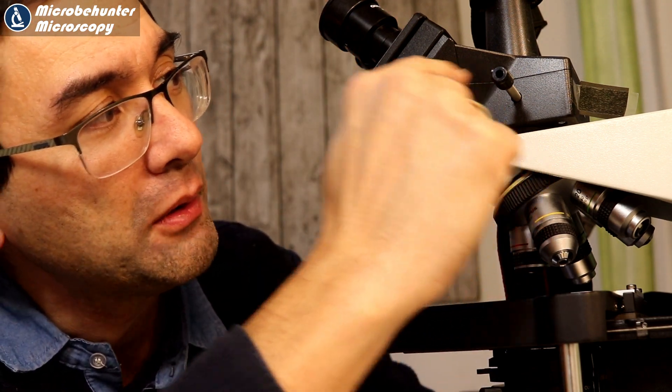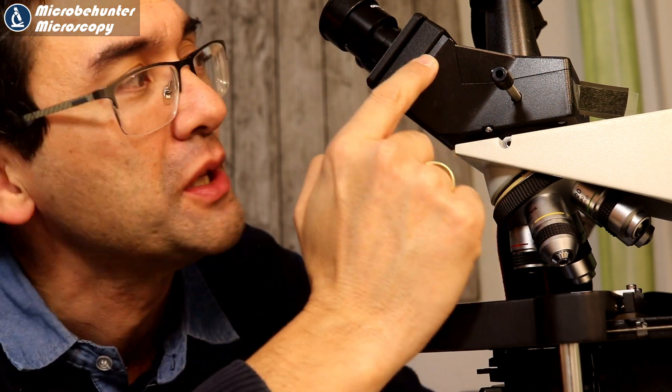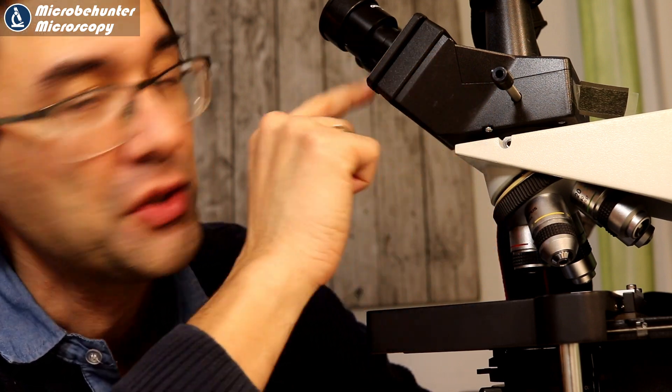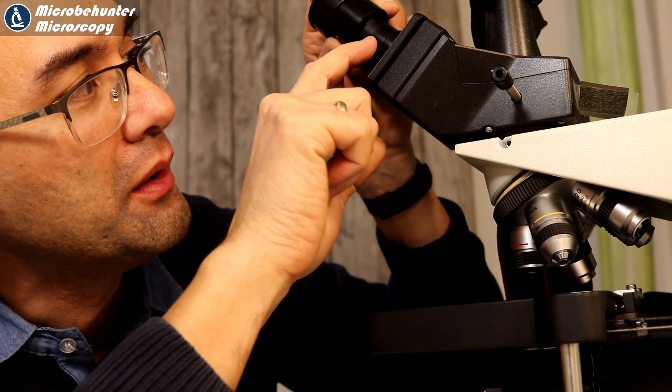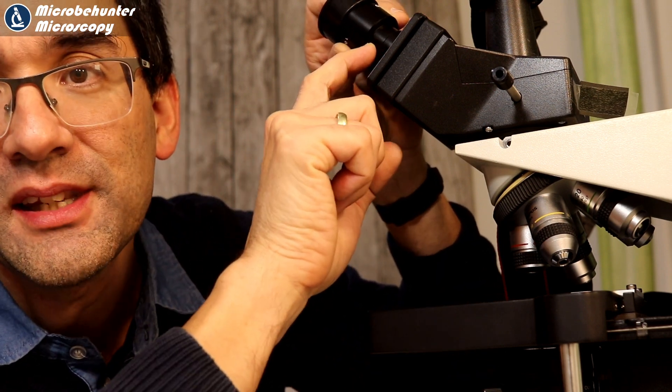...through the prism - of course you have to consider the prism as well because I've got a binocular microscope - and all the way then to the place where the eyepiece rests, this is 160 millimeters.